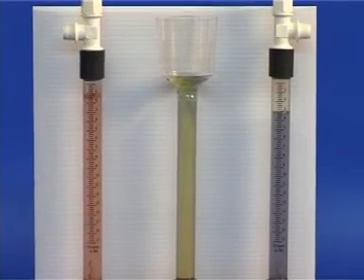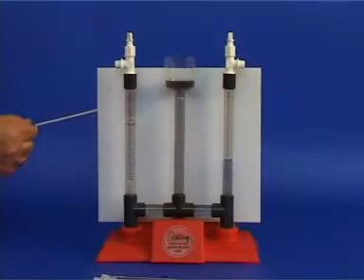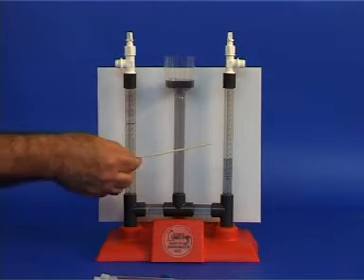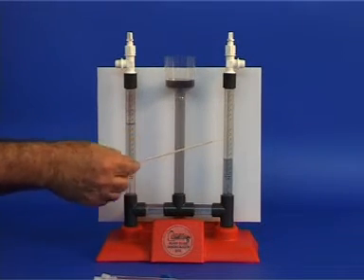The volume on the right side is double the volume on the left side. The gas collected in the left tube is oxygen and the gas in the right tube is hydrogen.